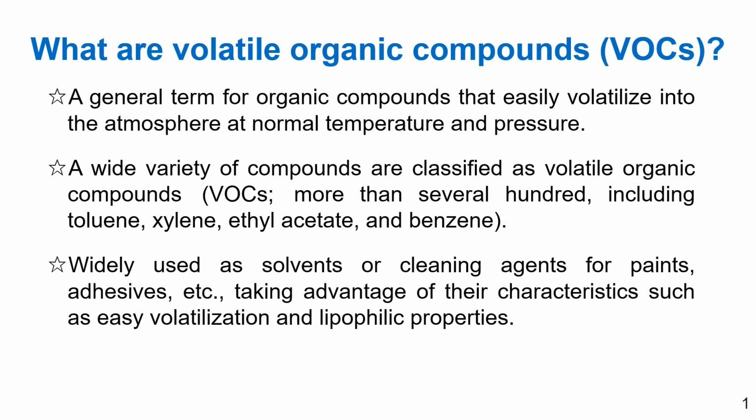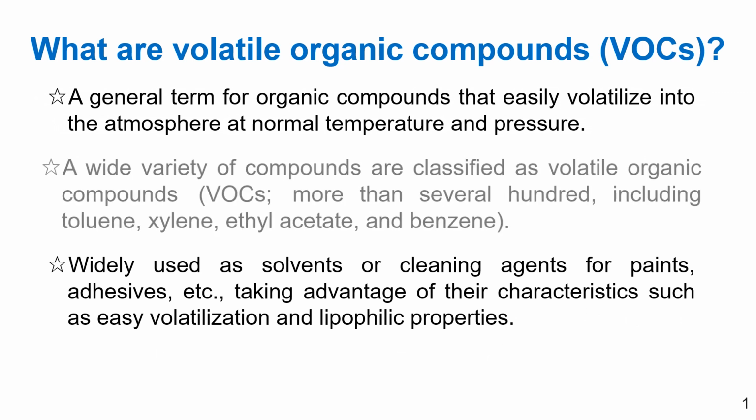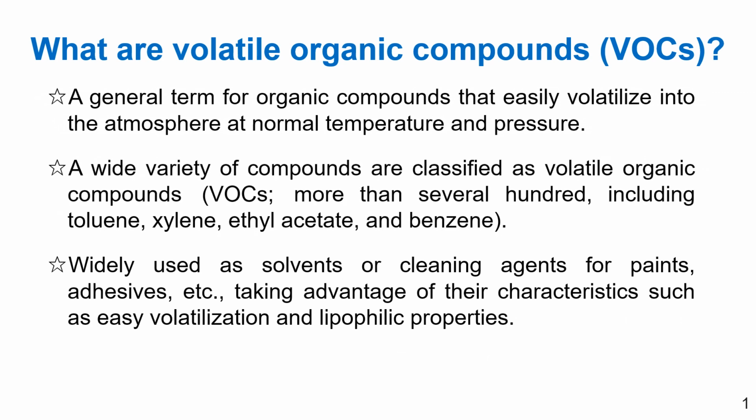First, I'd like to mention what volatile organic compounds, VOCs, are. VOCs is a general term for organic compounds that easily volatilize into the atmosphere at normal temperature and pressure. Typical VOCs include toluene, xylene, ethyl acetate, and benzene, and more than several hundred other compounds.